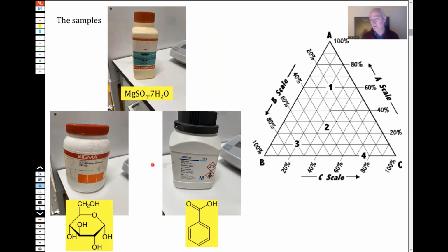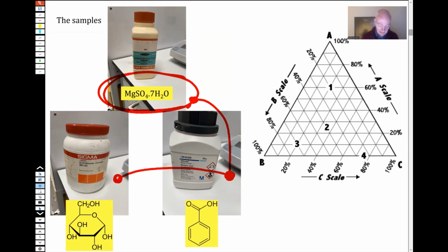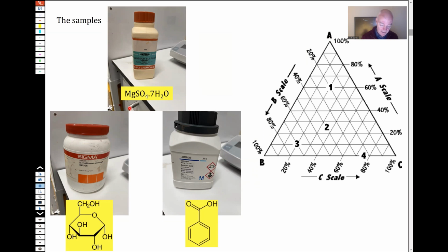They're also reasonably inexpensive. So from a sustainability point of view, as we're just trying to illustrate how you understand these sorts of things, it's good to use materials that are readily available and reasonably inexpensive. And they do have these very different characteristics, so it allows you to see these different spectral characteristics. And of course, you've already looked at this in your design of experiments. You have a tri-component system, a three-component system, so what you're looking at is how to make a good calibration space.